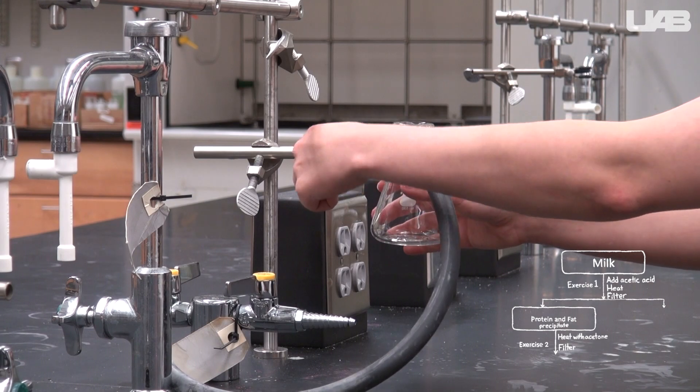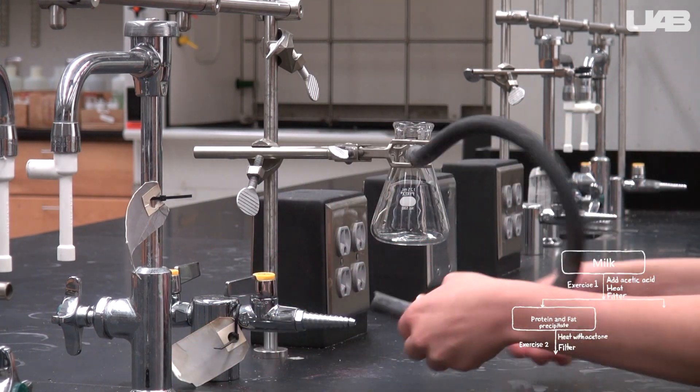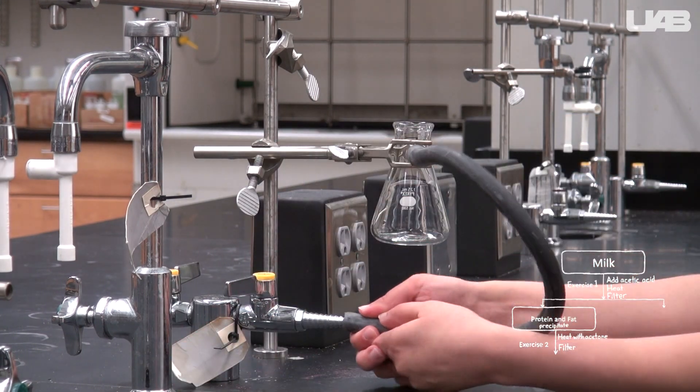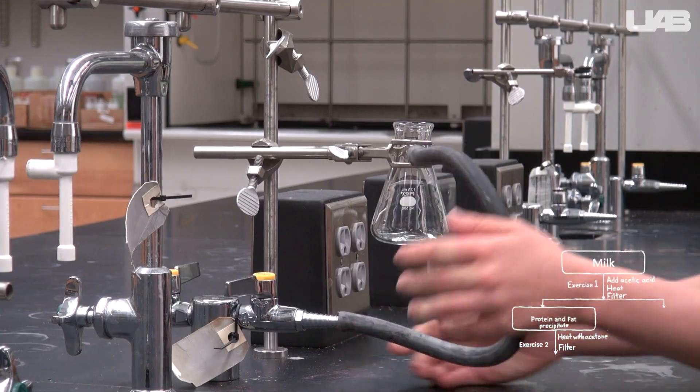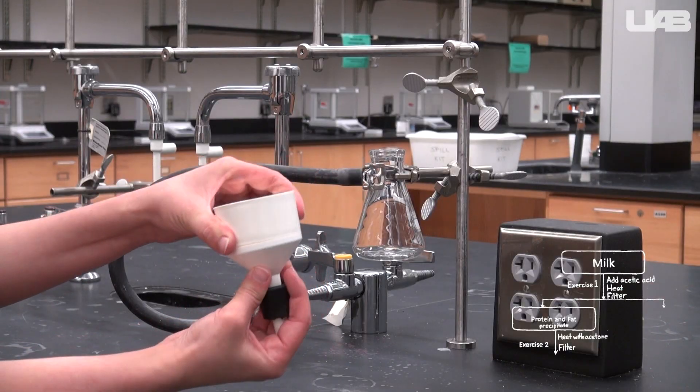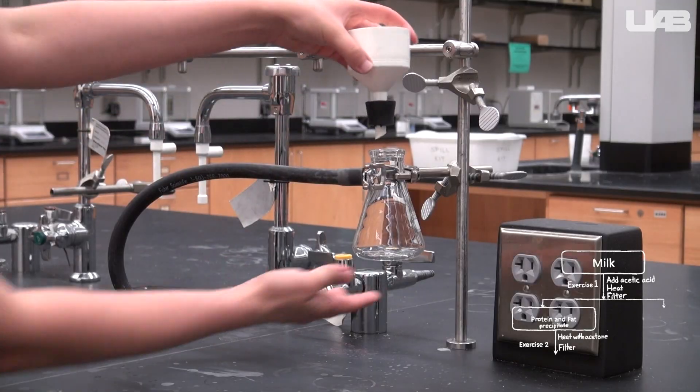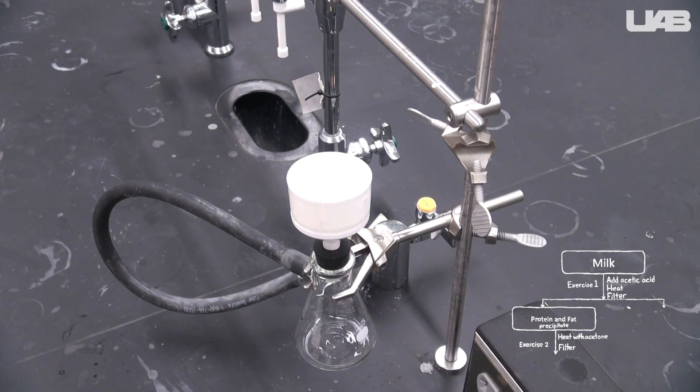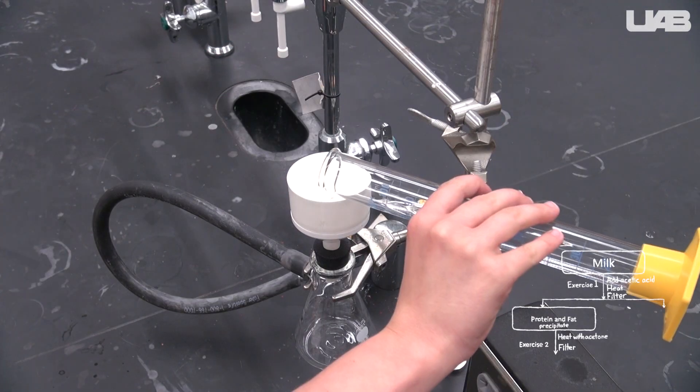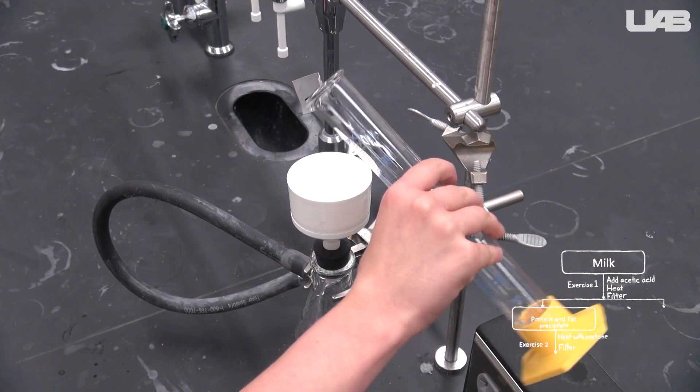First, we clamp the sidearm flask. The arm should go on the side with the two prongs. Plug the rubber tubing into the vacuum. Snap the two pieces of the Buchner funnel together and place it in the mouth of the sidearm flask. Place a piece of filter paper in the funnel and wet it with some of the solvent that is in the filtrate. In this case, acetone.